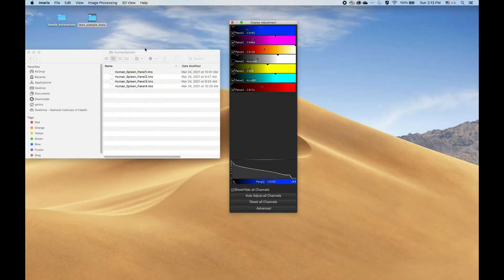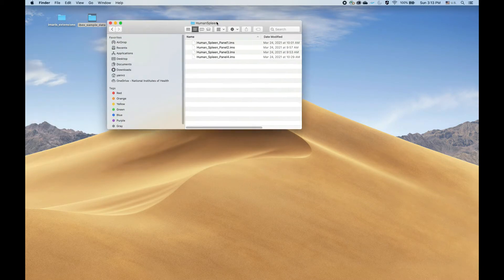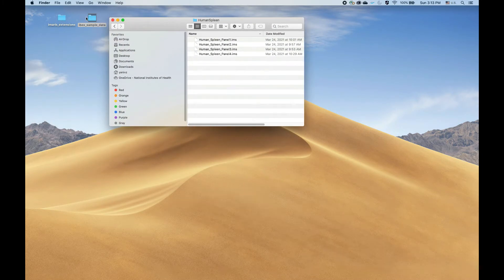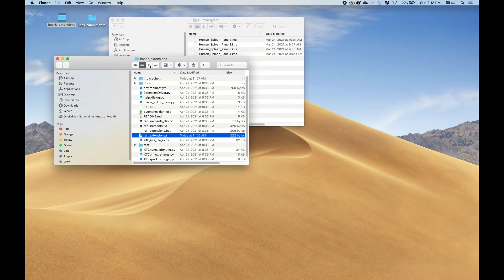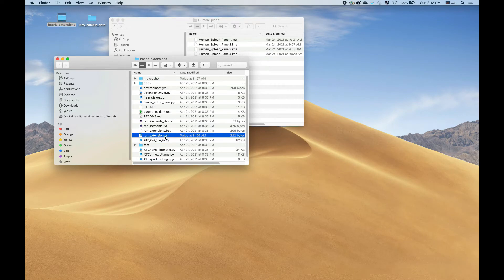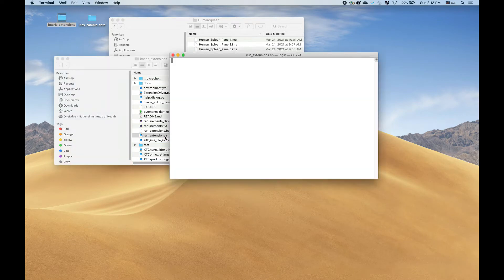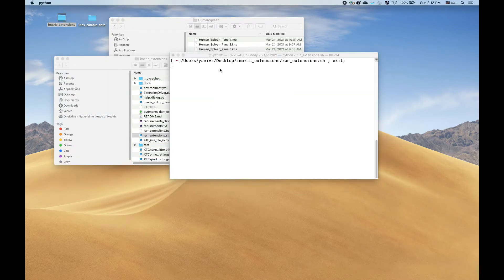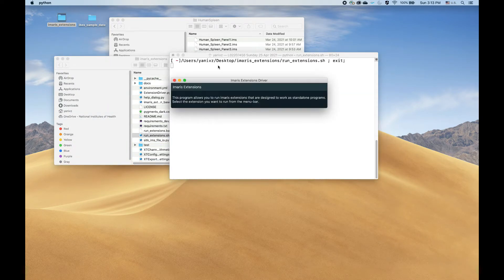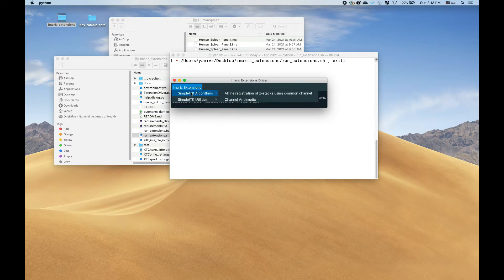We run the extension by running this driver script, which opens a menu, and from there we'll select the specific extension we want to work with. In our case, it's the affine registration.